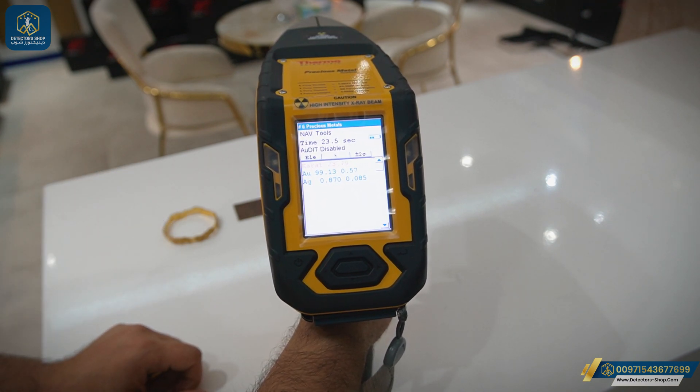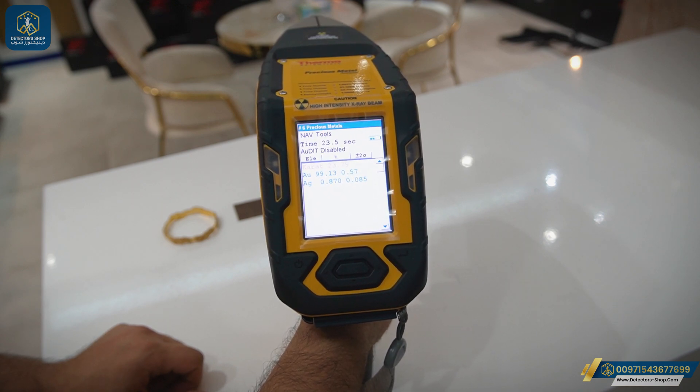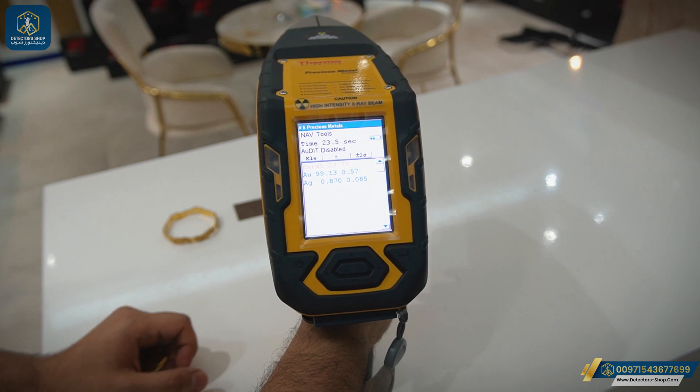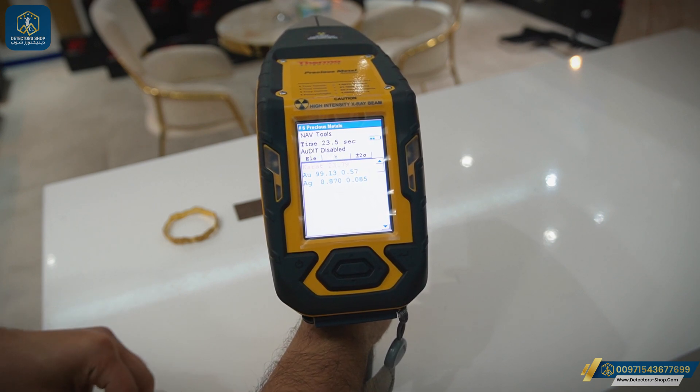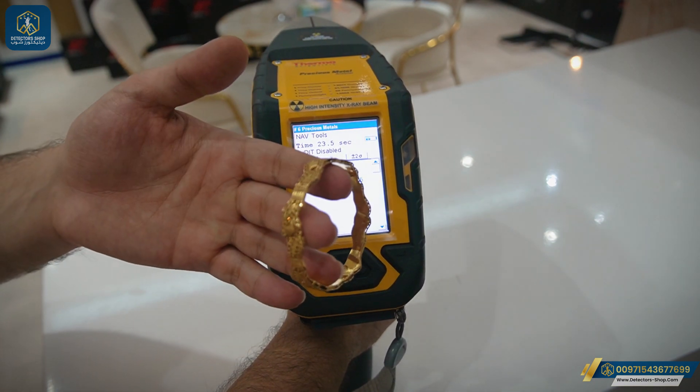Now we've finished our experiment. We have 23.789 carat, and we also have AU which is the gold element, and AG for silver. Now we'll do an experiment on a piece of manufactured gold.